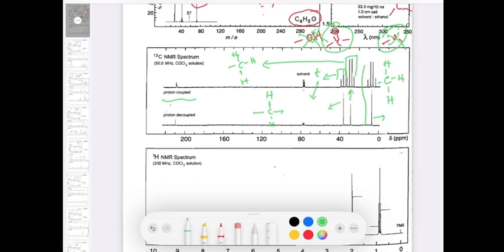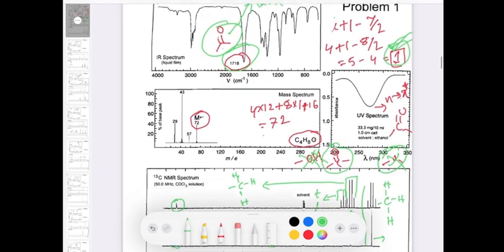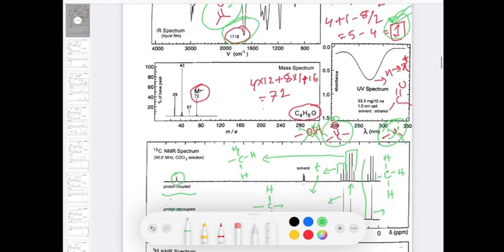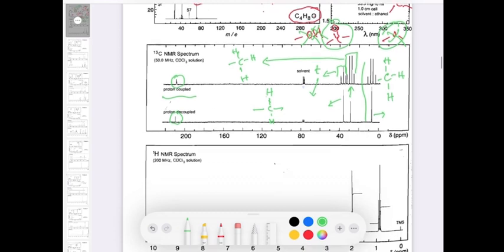But here in both cases you have a carbonyl group, and from the IR we already confirmed it is a ketone. Also, in my last video, especially the carbon NMR part, I mentioned that if you have any peak above 200, that is definitely a ketone. So you see that carbon already there.